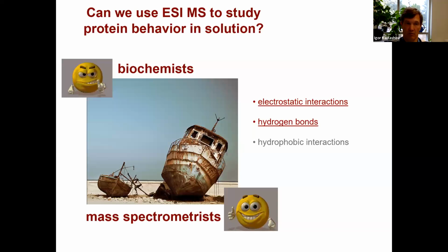The solvent is aqueous solvent. Obviously, that's a polar environment. And so there is always a competition between internal hydrogen bond formation and external hydrogen bond formation with the molecules of water, right? So now water is no longer around. And so whatever hydrogen bonds you had that were stabilizing your structure in solution, now they are even stronger, just because there is no competition anymore. Same is true about electrostatic interactions.